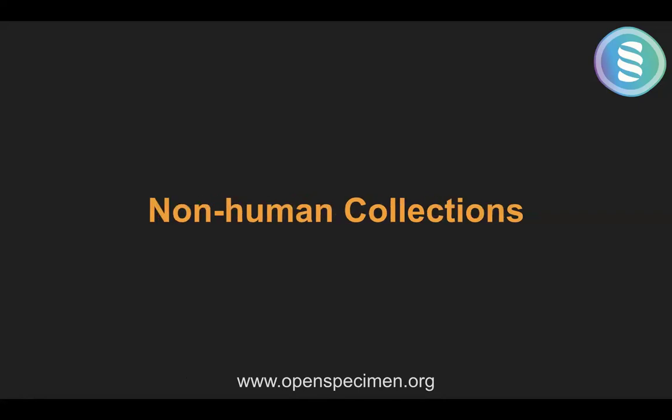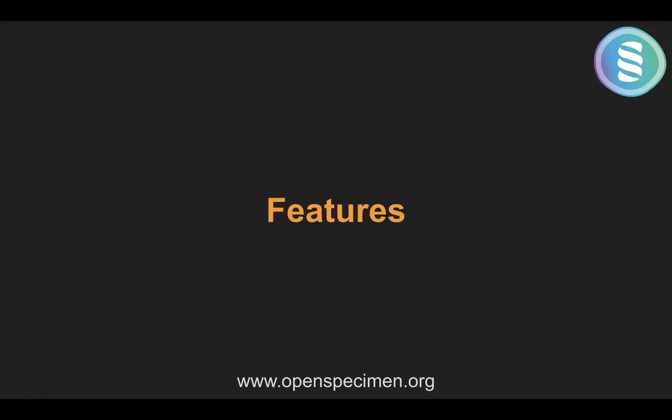We also support non-human collections. We have got customers who are veterinary biobanks, or within existing customers, there could be one or two studies that are non-human. And this also applies for cell lines, microbiomes, etc. So we have people who do all kinds of collections using OpenSpecimen.